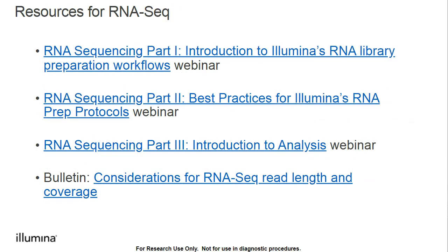Here's just some general resources I wanted to include if you're interested in RNA-Seq. There is a 3-part webinar series that goes through all of Illumina's RNA workflows. You can probably skip part 1 if you sort of have an idea of what kit you want to use. We went through the options here today for FFPE.